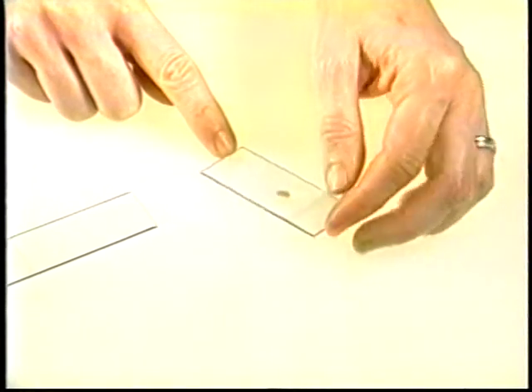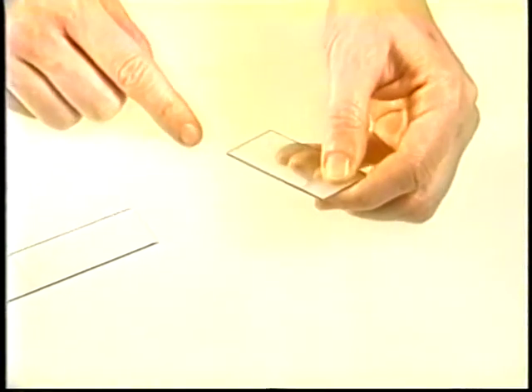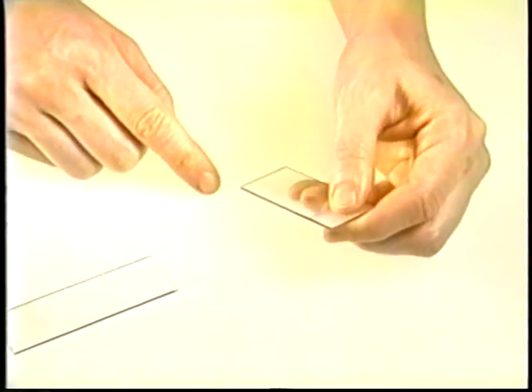Now that the harvest has been deposited on one or several slides, I will start the smearing. A small semi-solid droplet like this is the ideal harvest and can be handled by the basic smearing technique. This is done by first holding the slide with a droplet in a stable position but without unnecessary tension.